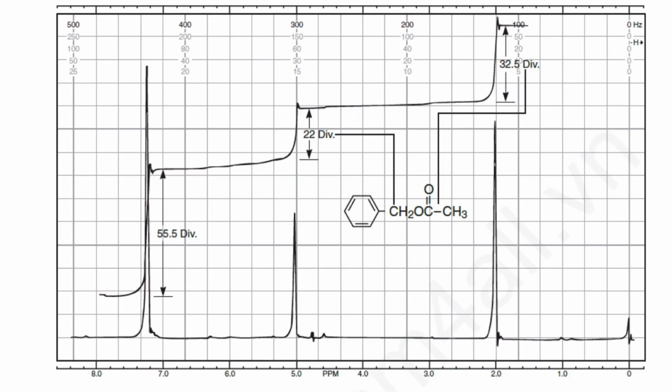So the NMR spectrometer has the capability to electronically integrate the area under each curve or peak, and it does this by tracing over each peak a vertical rising line, and this line is called the integral. This rises in height by an amount proportional to the area under the peak. So this is all about different types of protons and their quantity.